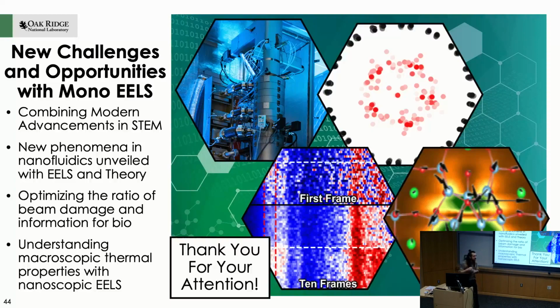And we also know from TEM that there's tons of small variations in terms of the inner diameter. So I'm willing to bet that if you got lucky, you could find a place where it went from a small inner diameter to a bigger inner diameter and could potentially see some change in that 460 to 420. Or maybe, who knows, the entire tube would display a different behavior in that circumstance. But can you in situ tune it, like how you chase the water to one corner?